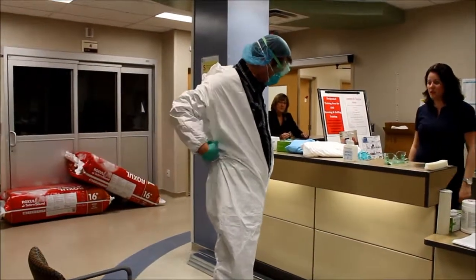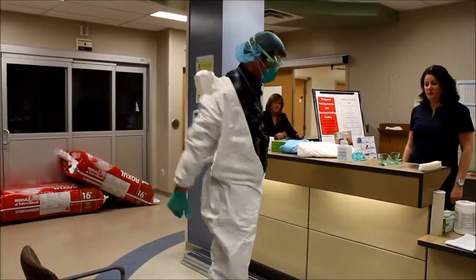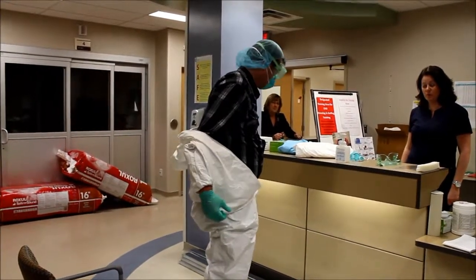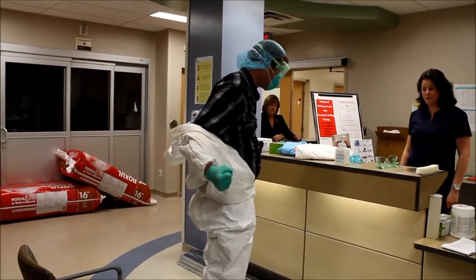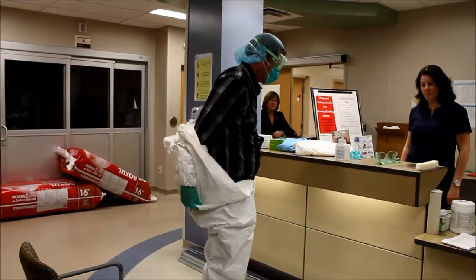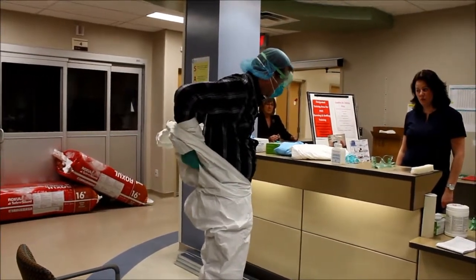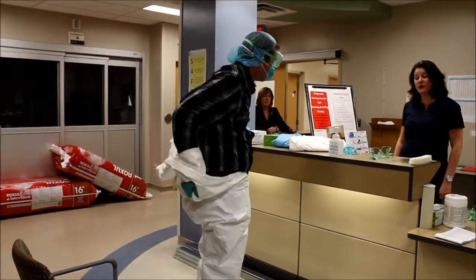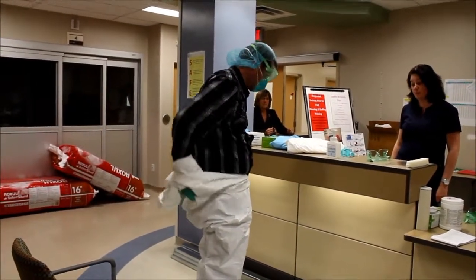Roll it down your body to take it off — this is quite tricky. Now you can move your arms inside; pull your hands through the sleeves. You're touching only the white suit. You're trying not to touch your scrubs, not to touch your body.